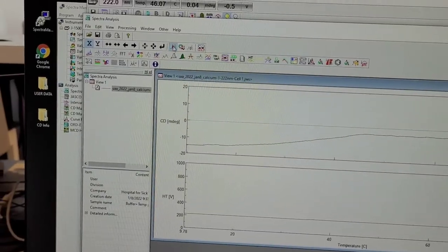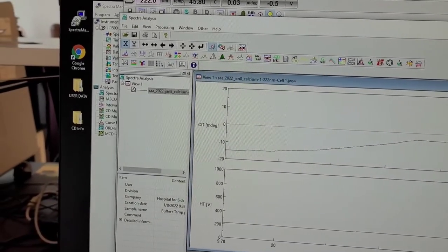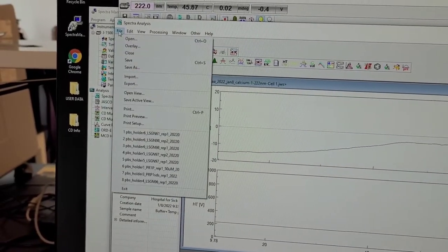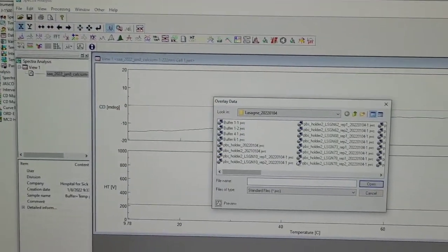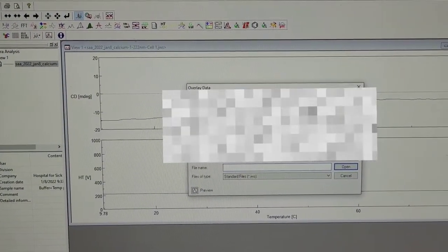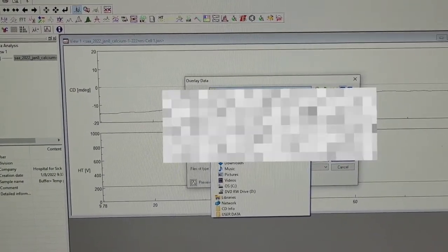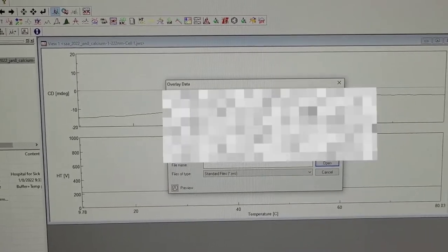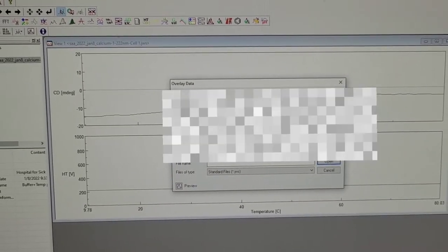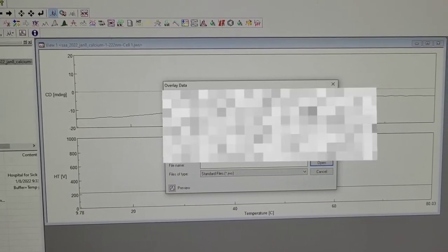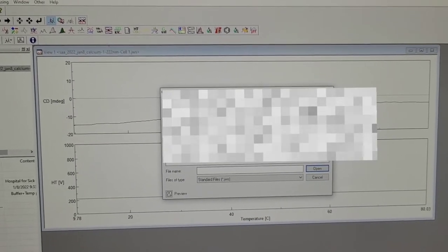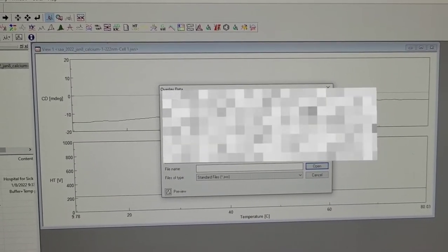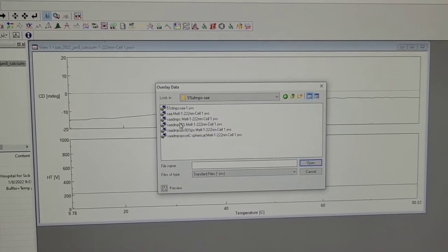So you can go to file, overlay, and choose another experiment that you ran before, and then overlay it and compare it to the data that you have.